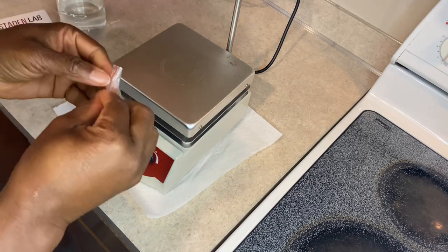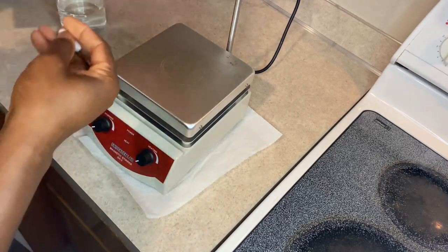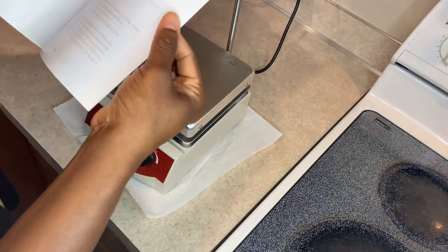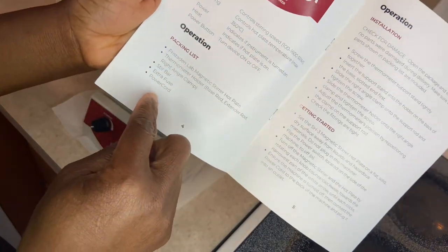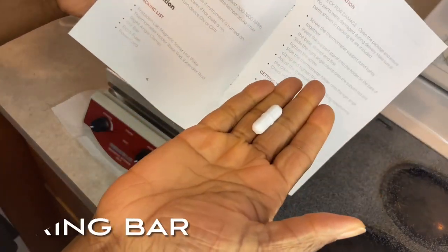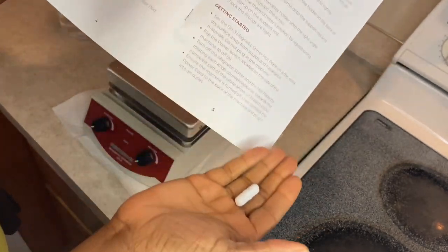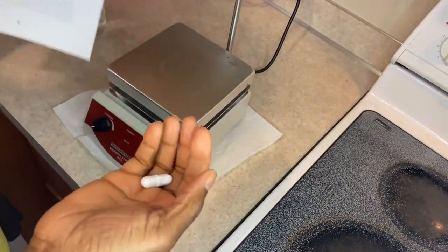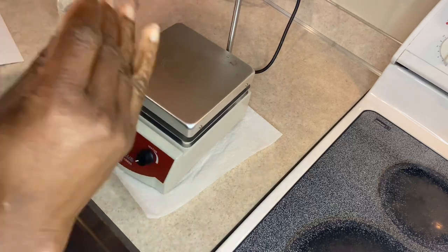The feedback I'm going to give them about the instructions is to show pictures, because the instructions don't show pictures of everything. Like, they have the packing list here — but I didn't know what this item was, and I'm glad I didn't throw it away. I thought it was extra stuff until I reached out to them and they sent me a picture showing what it was.